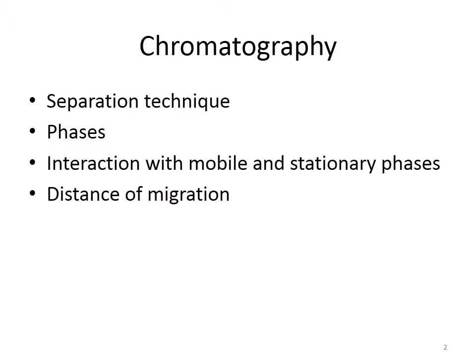The mobile phase, as the name says, is the phase which can move or which can flow. So the molecules which are to be separated move along the flow of the mobile phase. It depends upon the interaction of the molecules with the mobile phase and the stationary phase. If the molecules interact with the mobile phase more, they are going to be carried away with that mobile phase, and therefore they travel greater distance.